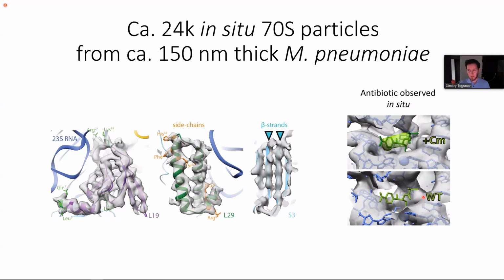And as far as I know, this is pretty much the first time that anyone has observed a drug binding exactly where it is supposed to bind inside the pathogen. Now, going from here, I mean, if you told me a year ago that we would have 3.7 angstrom from in situ data now, I would probably not have believed it. I thought it would still take quite a bit longer until we reach that level of resolution in situ.